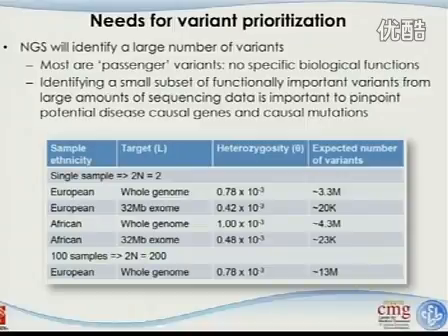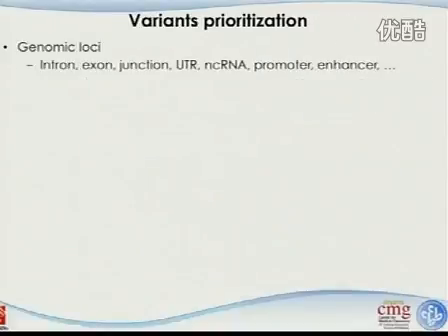So for the example shown in Tatiana's class, one of the examples, you see the 3.3 million variants. I suspect that was whole genome sequencing, unless they did something wrong. That was my question. So, yeah. This gives you some indication, before you go deeper, of whether your study had some problem or not. If the number of variants you identified is way off this expected number, you may find that it's not trustworthy and there are some problems.